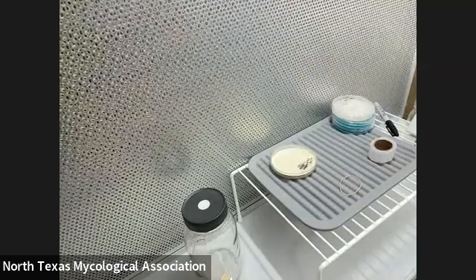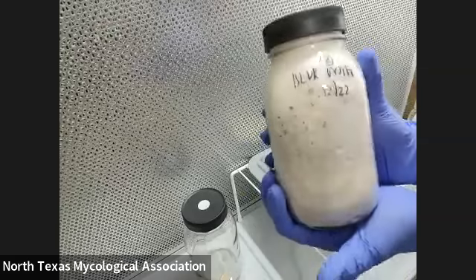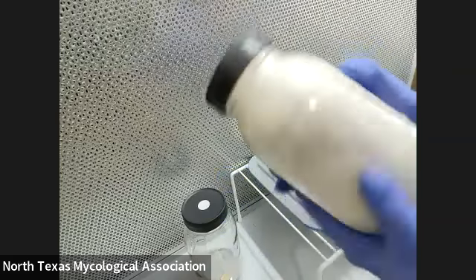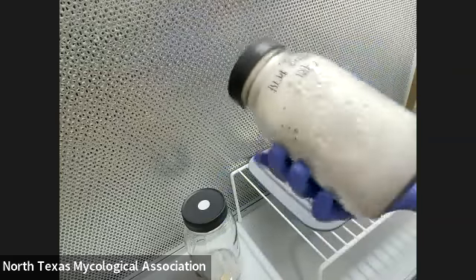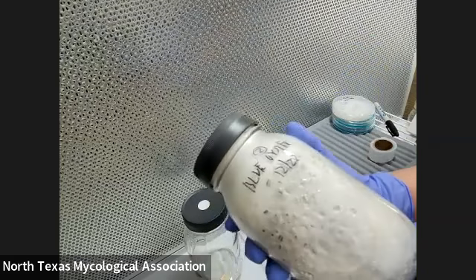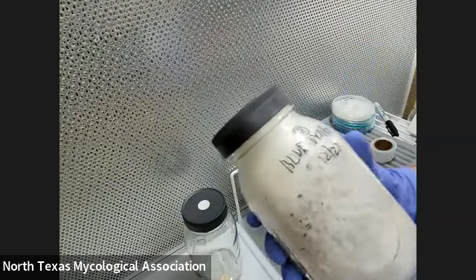This is blue oysters from 12/22, so that's like almost two months. It's going to look like this — not this bad, just because I let it sit for like two months, turning white and spreading all over the grains.